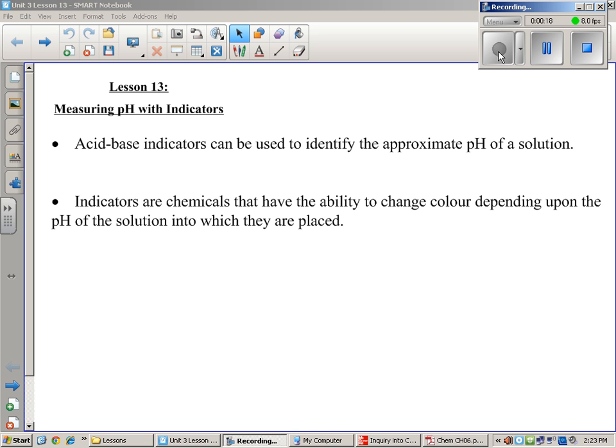We can also use pH paper like we did last day, which is still a pretty good indication. You can get it down to 5, maybe 5.5. You could kind of guess colors in between on that pH scale. You could get 8 or 8.5 or 9, probably. Anything more specific than that would be tough.